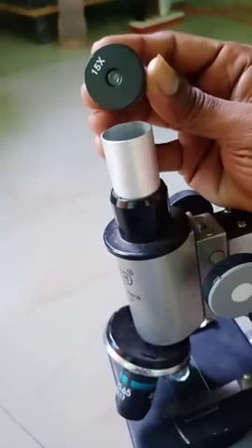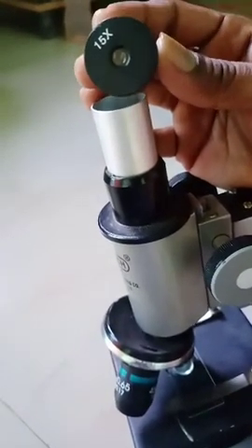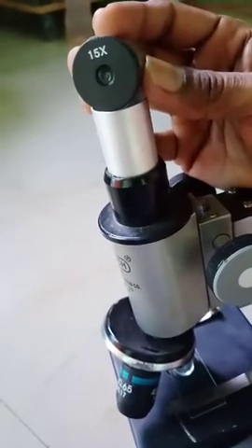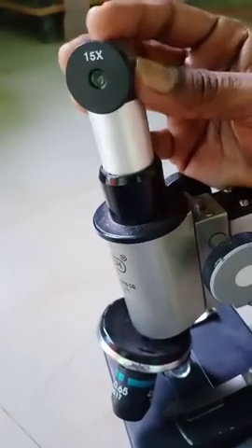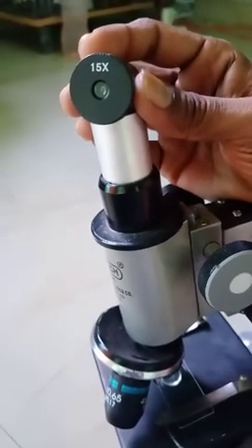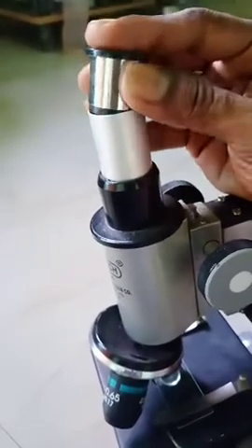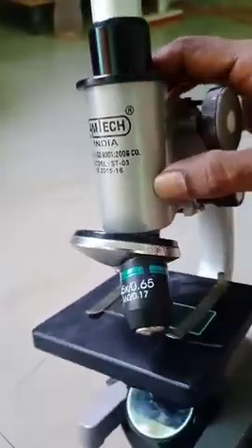X means times. 15x means we could observe the object or the sample 15 times bigger. 100x means 100 times bigger. Remember, eye lens, eyepiece.